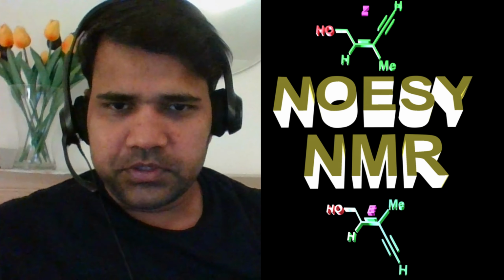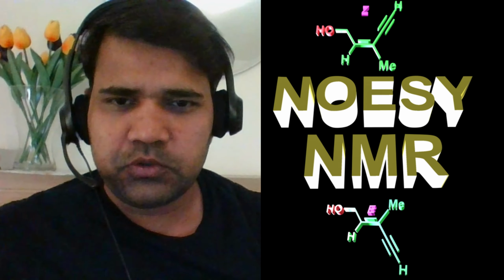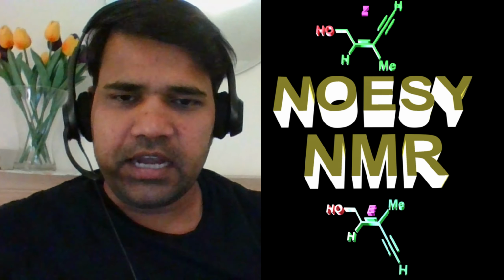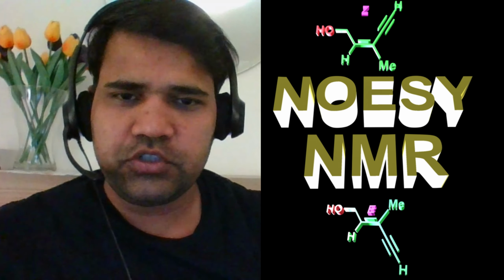So that's all for today. I hope you find this explanation helpful, and I hope you understand how to use the NOESY NMR to distinguish between the geometrical isomers. And in my previous video, I used the NOESY NMR to distinguish between the regioisomers.